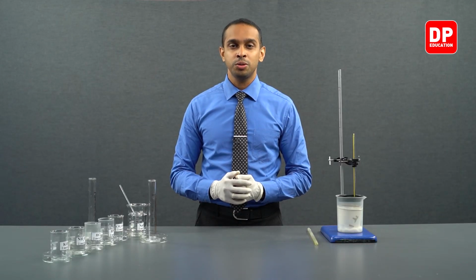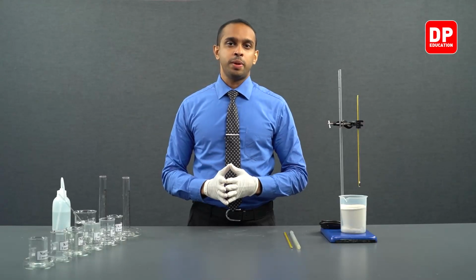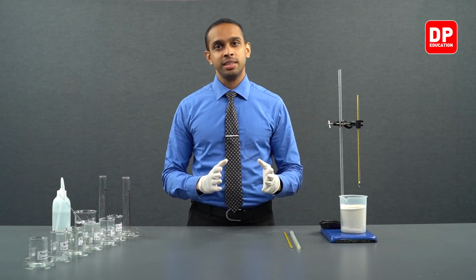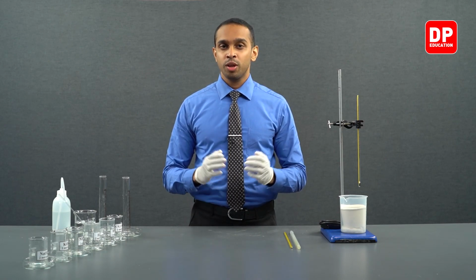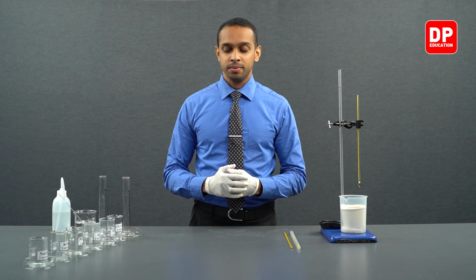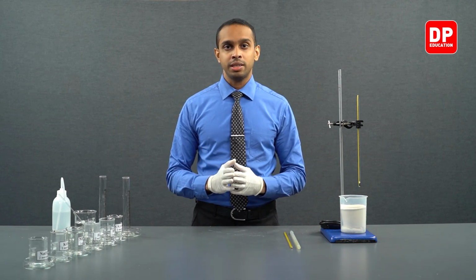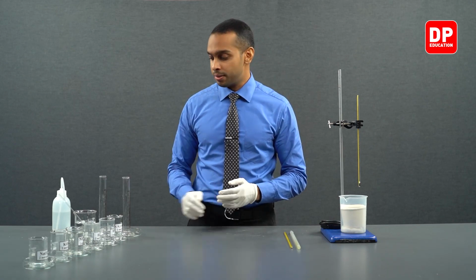Now, let's move on to our final part of this practical. In our final part of this practical, we are going to observe a reaction between a strong acid and a weak base. For the strong acid, we have chosen hydrochloric acid, and for the weak base, we have chosen ammonium hydroxide. Now, let's measure 50 milliliters of hydrochloric acid and measure the temperature of our hydrochloric acid.